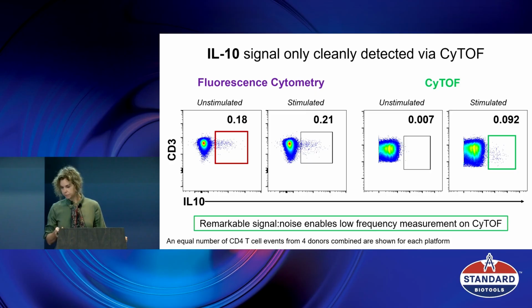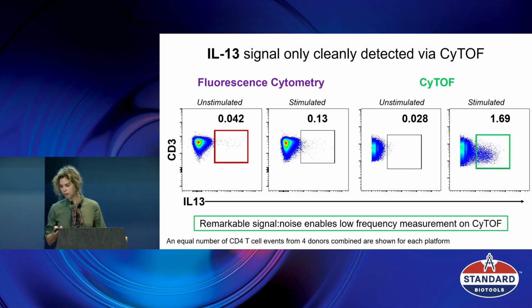And with IL-13, we see a different pattern. That was the most striking, I think, result that we ever had. So again and again, we see it. IL-13 is not detectable by flow cytometry in the hands of like 10 labs that I checked with. I mean, you can see 5 OMIPs that have IL-13, and the data look really poor. It's hard. You cannot really see it no matter what color you use.